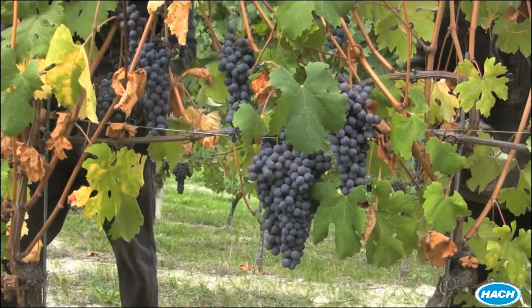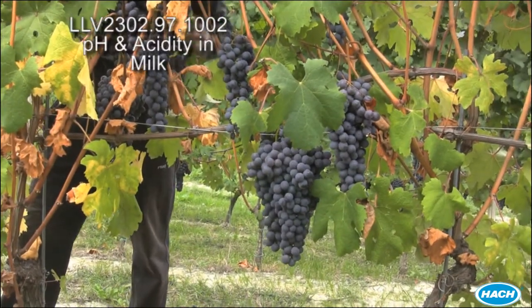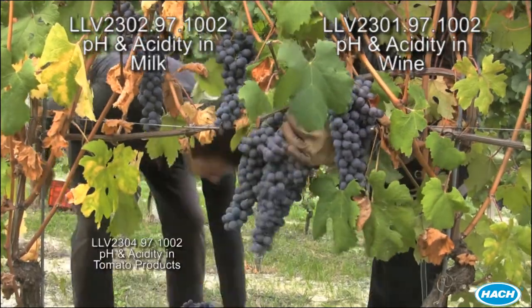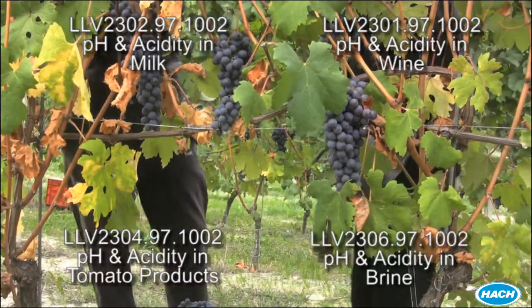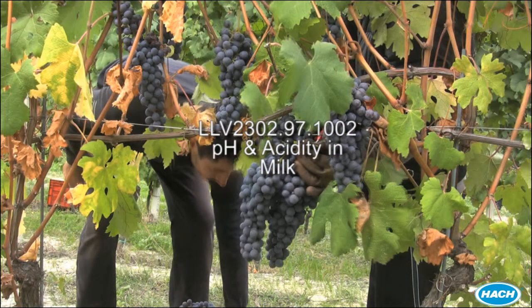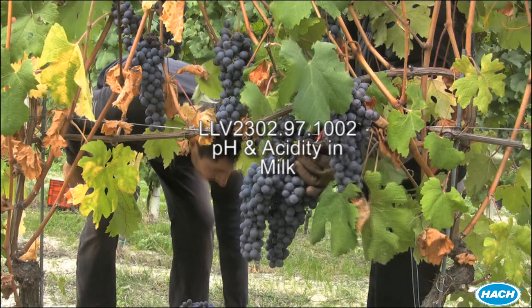Hach's Titrolab for pH and total acidity is available in four different sales versions: dairy products, wine, tomato sauce and tomato products, and brine. Our demonstration today will specifically be using the pH and acidity in milk instrument.